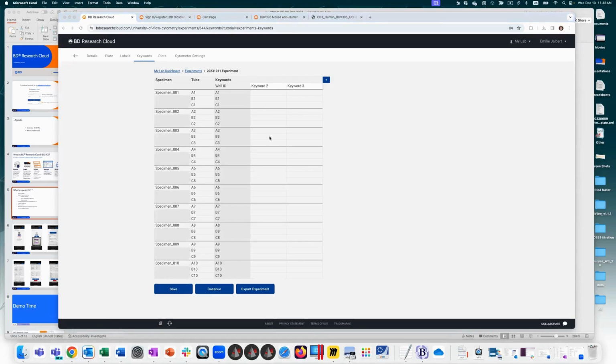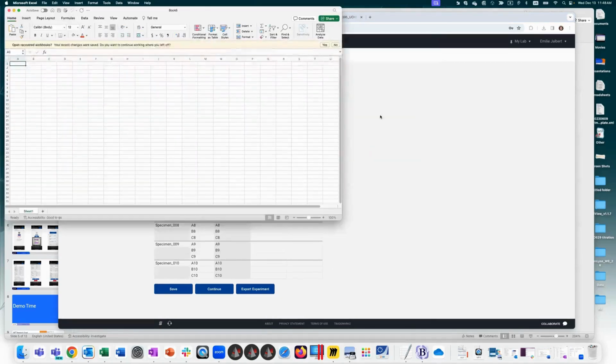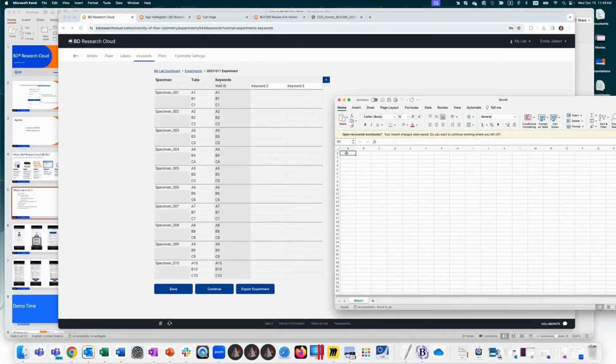So if I just say create a new spreadsheet for demonstration purposes. So how many samples do I have here? 10. A, H, I, whoops, J. Okay, so then, assuming these are long, very complicated names, I don't want to rename manually.